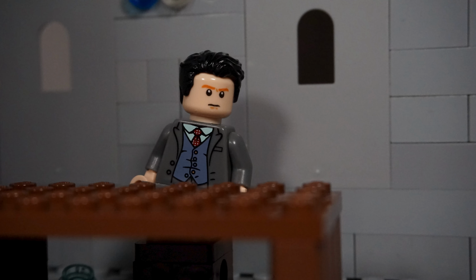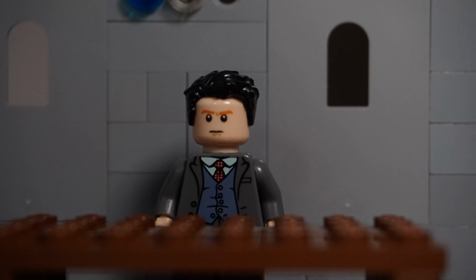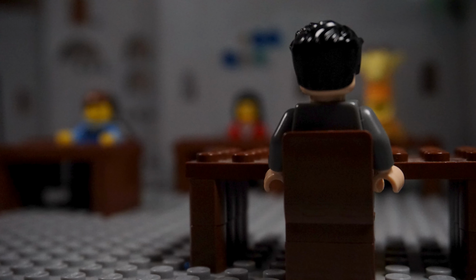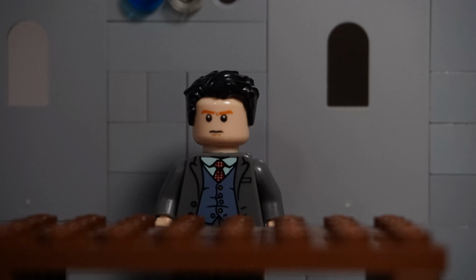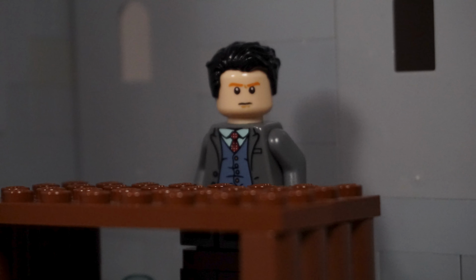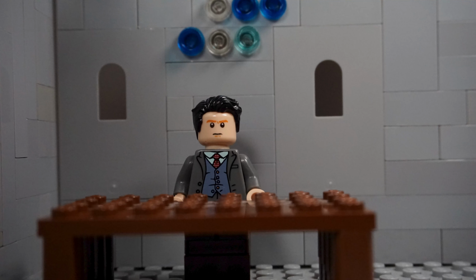A few other general things are that you should never eat or drink during a lab experiment. This includes gum and smoking. This is because it is easier to ingest dangerous chemicals while doing any of these. Also, never deviate from the directions of a lab assignment, as if the instructions are not followed carefully, then experiments can go very wrong and become dangerous to your health.